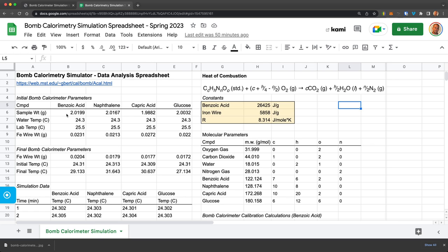And then I did this, as you can see, for naphthalene, a fatty acid, and a sugar. And so this gives me all of the data from the simulation. And now I can use that data to get the heat of combustion.